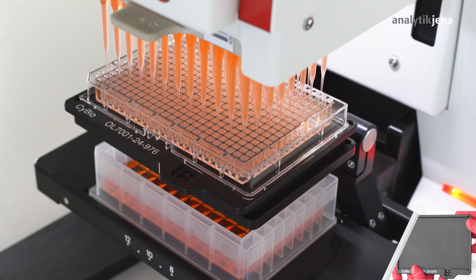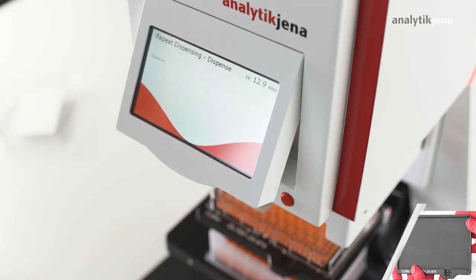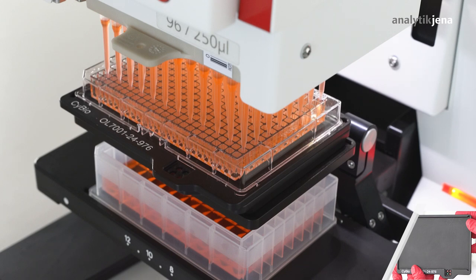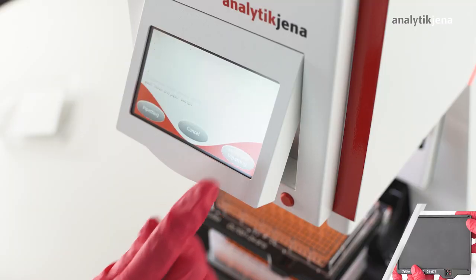The following first dispense step in the first quadrant is then confirmed through the move and pipetting button. With the help of the sliding mechanism, the 384 microplate adapter is then moved to the next quadrant, and the next dispense step is executed through the move and pipetting button.